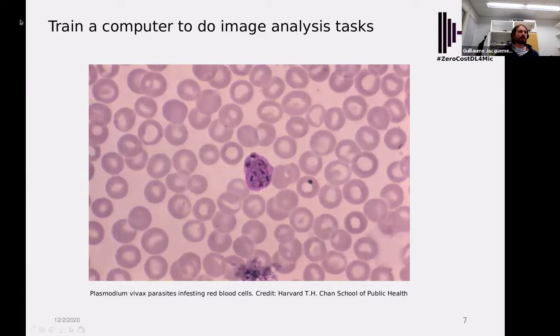By that, I mean that if you just look at this image, in a few seconds, your eyes and your brain behind it will have been able to identify patterns. You will see that there are a lot of objects that are round, that have specific colors, and you know that those objects are very similar to each other. Even so, you would not have any idea of what is in this image. If you have absolutely no biology background, you will not be able to recognize red blood cells in this image. Your eyes have been trained to identify objects and patterns from your birth.